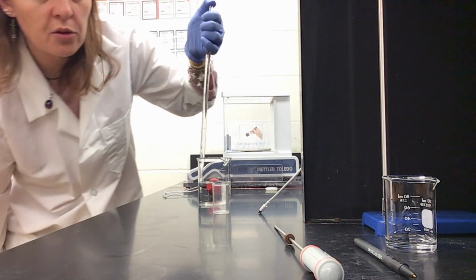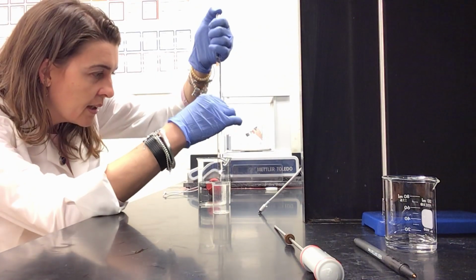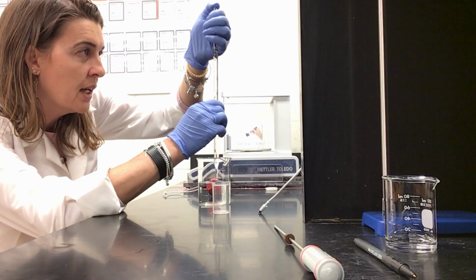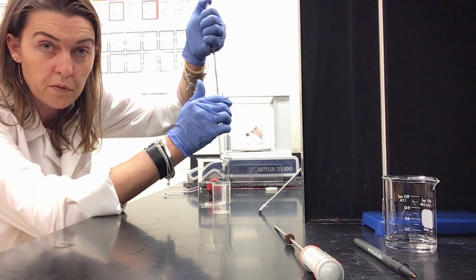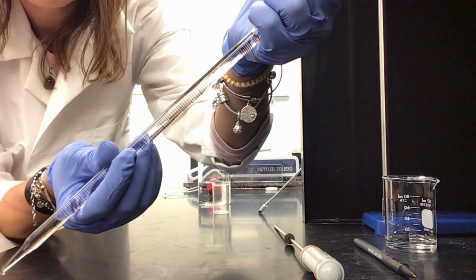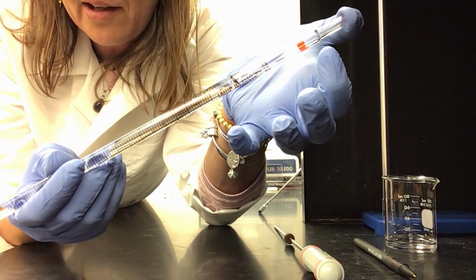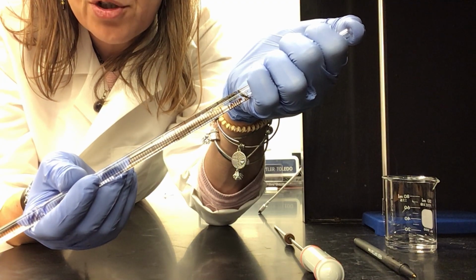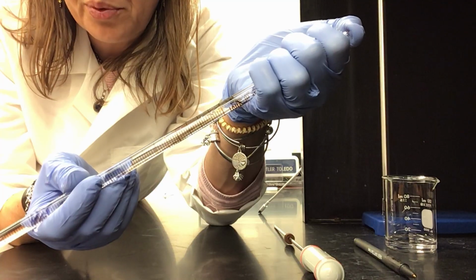okay? I am gonna sit on a stool because I need to look at the meniscus, okay? Turn it appropriately and release slightly the pressure with my thumb. As you can see, it's going slightly down. I am gonna show you very closely what is going to happen. See? Look at the volume here. So now I'm not gonna drop on the table. I have a small beaker here. So if I release slowly, the pressure on my thumb is going down, down, down, down. If I put pressure, it will stop, okay?